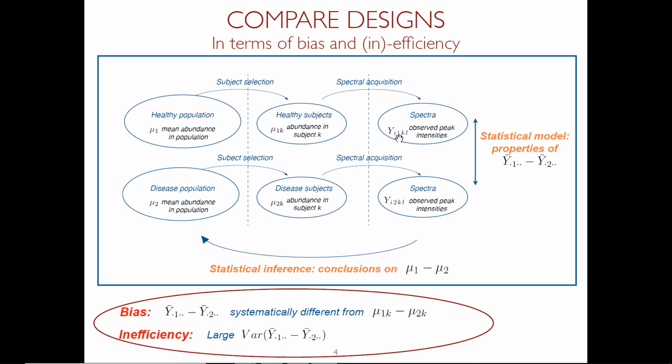And we observe them for each biological replicate and potentially even in multiple technical replicates, potentially even with multiple features such as peptides or peptide ions per protein. And then what we need to do is to aggregate this somehow and use this to make statements about the unknowns, right? About the difference between the means. And we need to watch out for the variance and for the inefficiency.